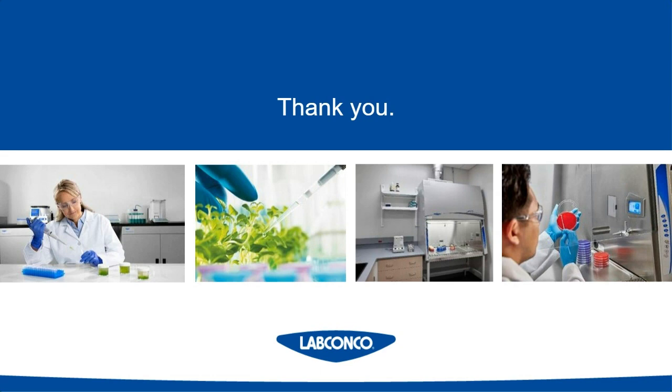You know, we had a question earlier about the A/B3 style cabinet, and those just aren't made anymore because they just couldn't keep up with today's safety standards. We've found better ways to exhaust cabinets. So while biosafety cabinets can last a very long time, typically we would say every 15 years or so, you should probably review replacing your cabinets, just because the technology changes and the way they contain improves over time. We often get asked about the HEPA filters. How long will they last as well?